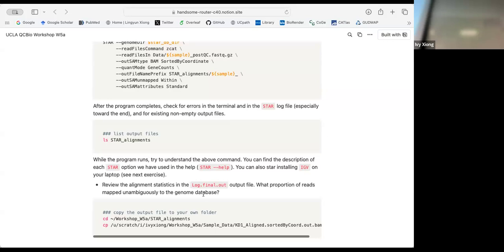Let me try. But my file that I'm using isn't... So does that mean I can...? You can just zip it then. Do that again. I just did the fastq before because I noticed that these ones weren't working. I didn't notice the size.